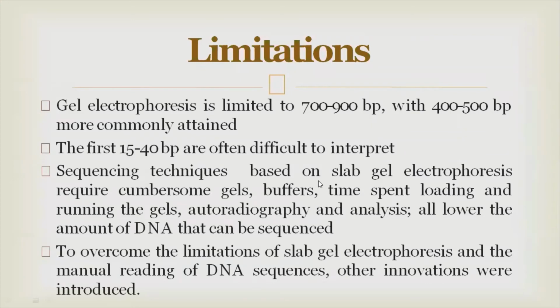So I hope I have made this very clear. In the meantime, maybe we can watch a video of the Maxam-Gilbert method. Just a minute. Let me see if I can put it up. Okay. It is not very difficult to understand the Maxam-Gilbert method or Sanger sequencing.